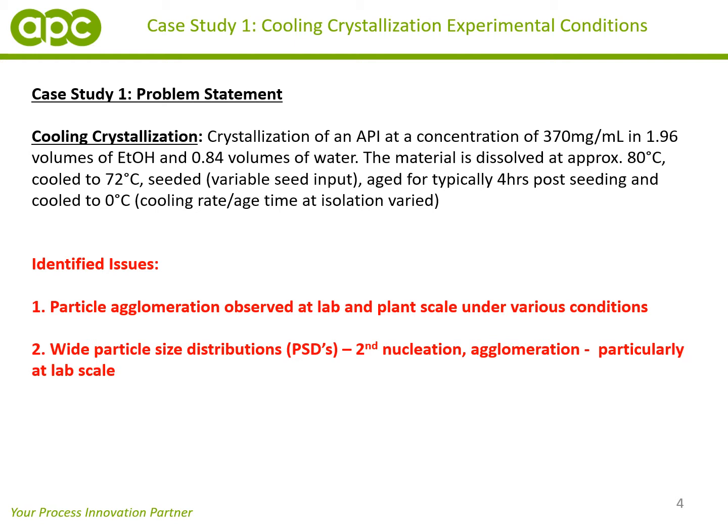And two of the main issues identified were particle agglomeration observed at lab and plant under various conditions, and wide particle size distributions, PSDs, typically as a result of secondary nucleation and agglomeration, particularly at the lab scale.